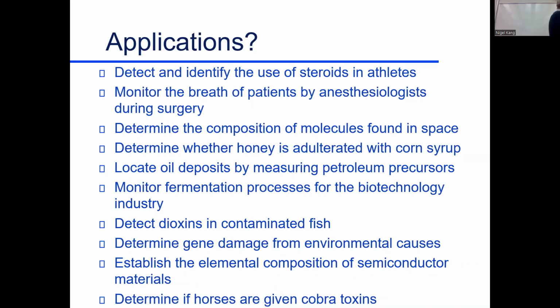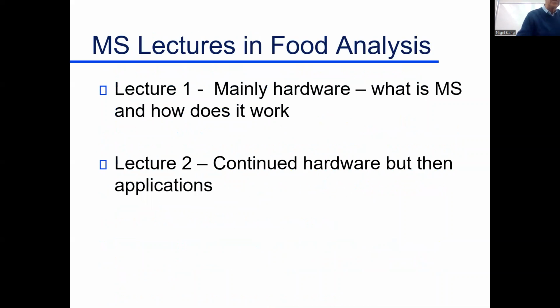Monitor fermentation for biotechnology. I could go on for page after page after page, literally, of where mass spectrometry has come in. As I said, at one time, this was a technique only used by few, and now it's used by many. It's simply become a routine tool.